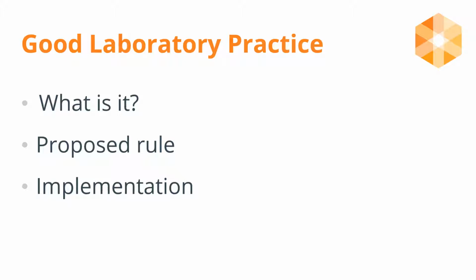This presentation will define good laboratory practice and explain why it's important. It will also touch on the regulations as well as outline the proposed changes in the requirements and how these requirements will be implemented.